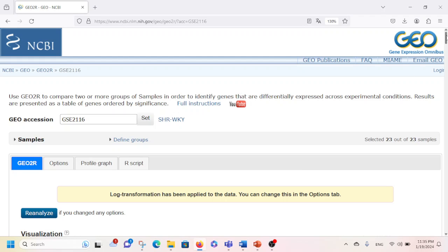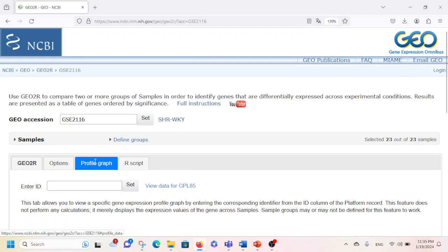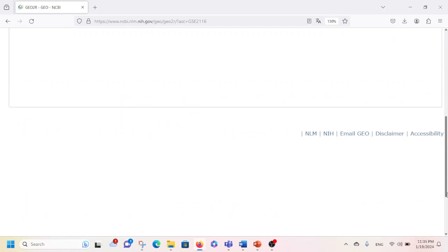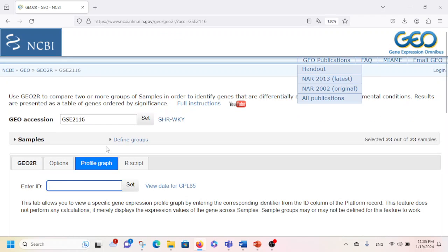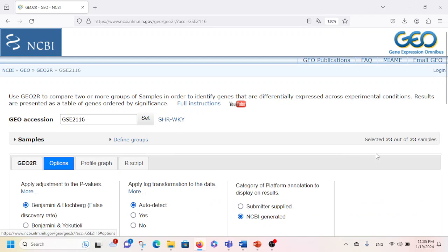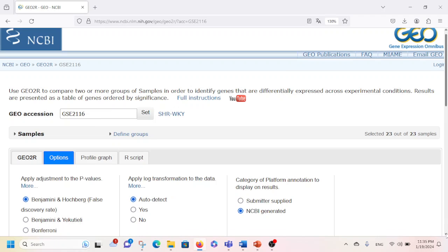You can also click on Profile Graph, enter the gene ID there, and then perform the analysis.